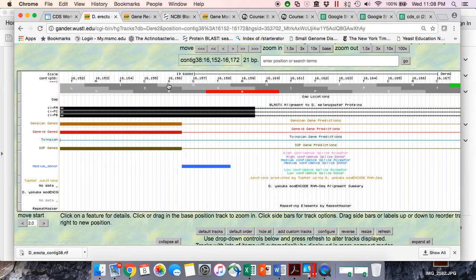That means this would be the last nucleotide of our exon. The prediction programs say it stops right here. That looks good. The splice predictor programs like this as a splice site. Cool. Fortunately, there doesn't appear to be any sequencing data here.